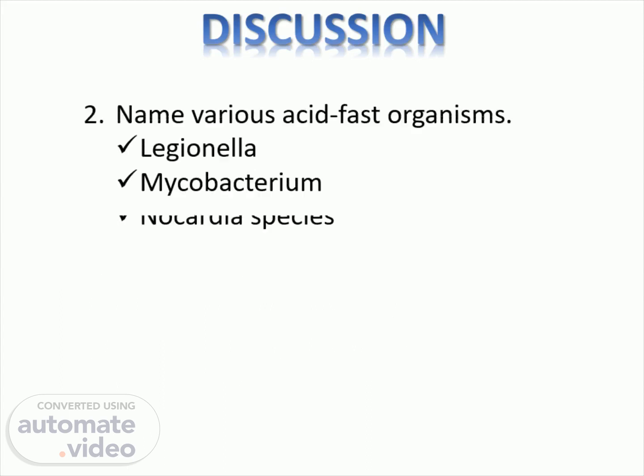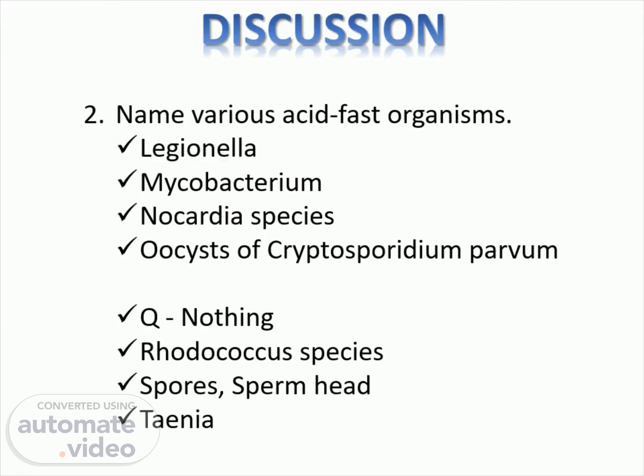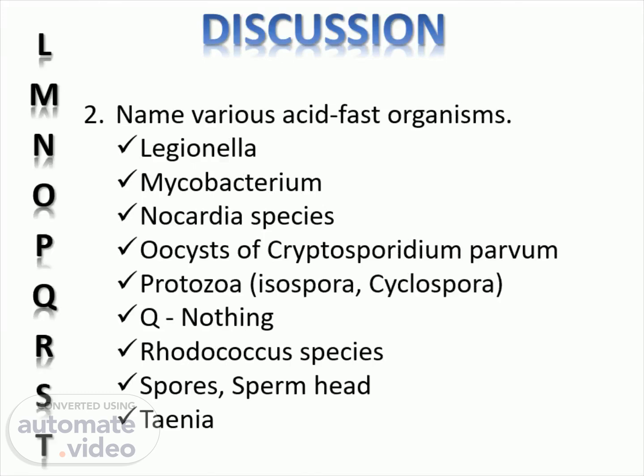The mnemonic is LMNOPQRST. L: Legionella. M: Mycobacterium. N: Nocardia spp. O: Oocysts of Cryptosporidium parvum. P: Protozoa, Isospora, Cyclospora. Q: Nothing. R: Rhodococcus spp. S: Spores, sperm head. T: Taenia.